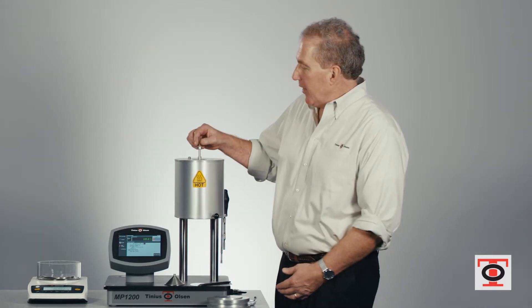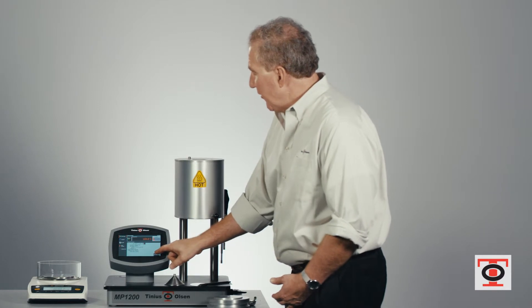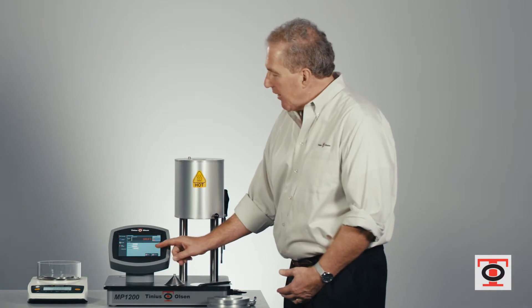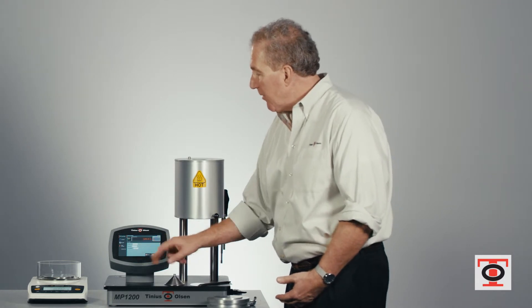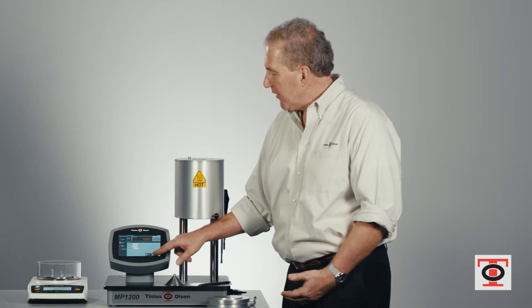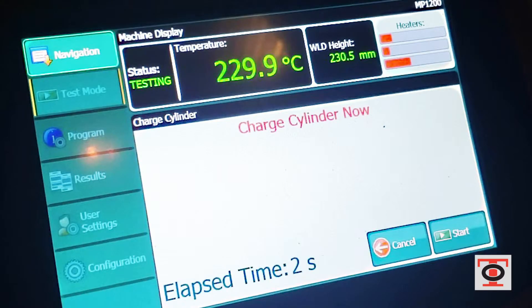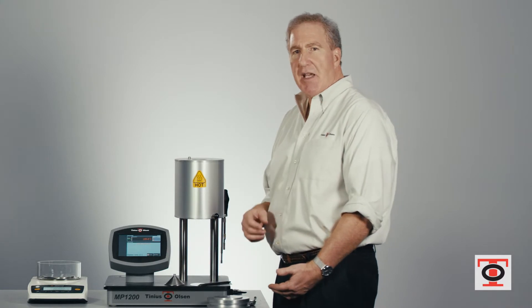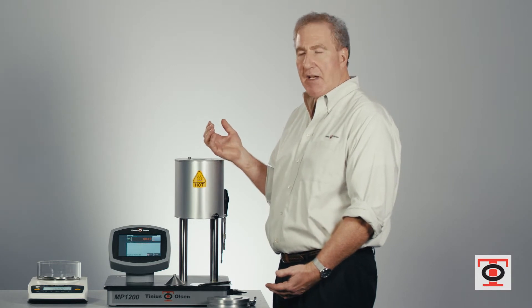When you're ready to run the test you remove the piston and go ahead and press start test. If you entered any sample identifiers for information about the test you can enter that in by simply pressing on the box, getting the keyboard, entering in details about the test, and then pressing continue to move to the next screen. What appears now is a screen that says 'charge cylinder now' and it gives you a little countdown time period. That countdown is for loading the material, putting the piston back in, applying the weight, and starting the preheat time — all within 60 seconds.